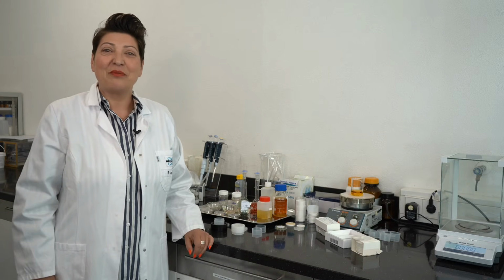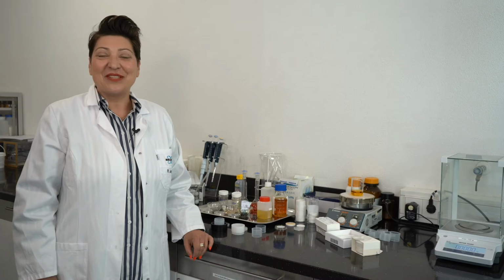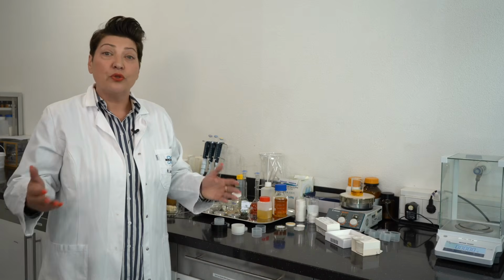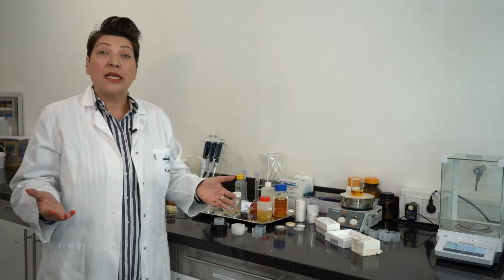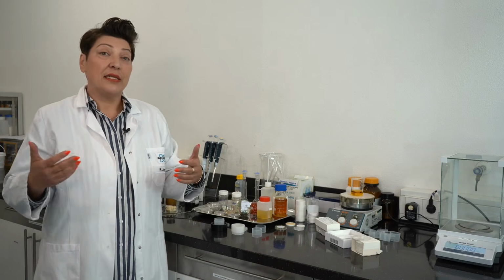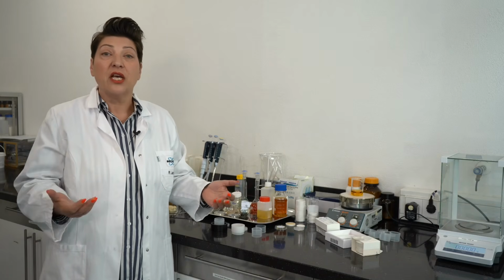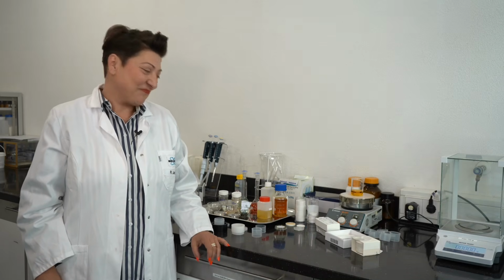Hello and welcome to our preparation lab here in Karlsruhe. My name is Renata Janic. I'm working as an application scientist here, and I would like to show you today how to handle liquid samples, and how to handle more challenging and complex samples, which could be liquids or pastes. So therefore, let's start with some sample preparation.